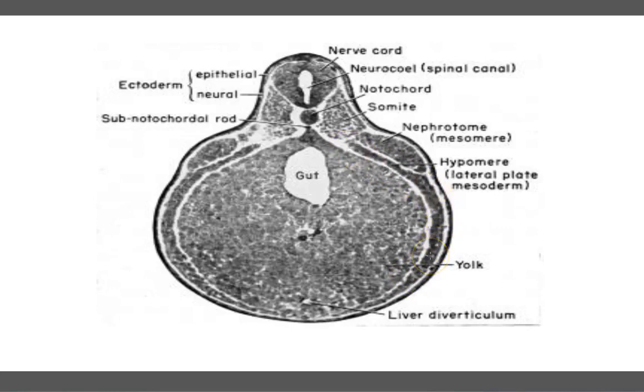At this point, it has not split up yet, but you can see some lightening already in the middle. So once this splits up into two, the outer layer will become your somatic layer. The inner layer will become your splanchnic layer. And the cavity formed in the middle will become your splanchnocoel. And here, you have what remains of the archenteron. So, this is now your primitive gut. Because you remember, the notochord was pinched off from the roof of the archenteron, and then your mesoderm was pinched off from the side of your archenteron, and whatever is left becomes your primitive gut.